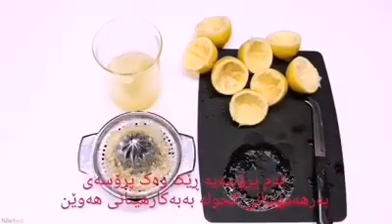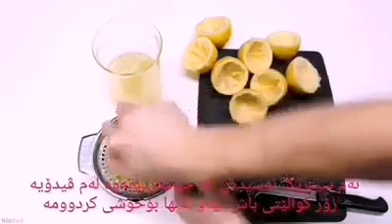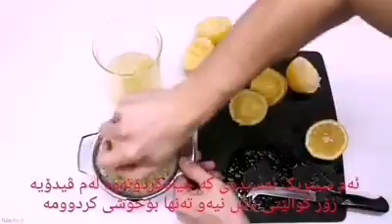This process is very similar to the production of alcohol using yeast. The citric acid that I extract in this video is not going to be the highest quality, and I'm mostly just doing this for fun.